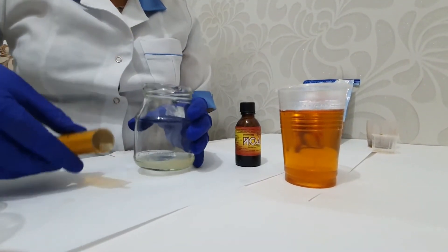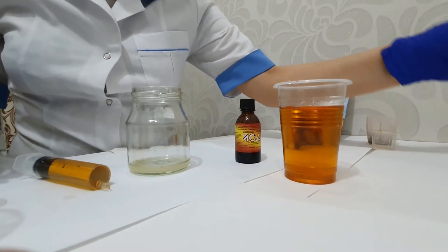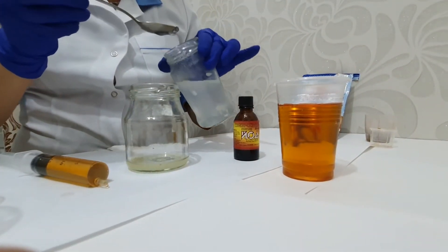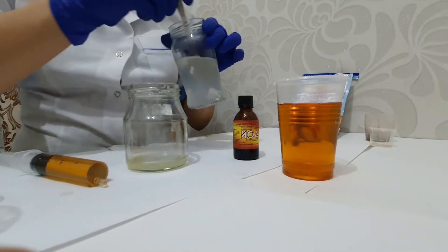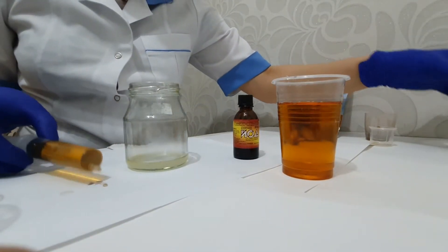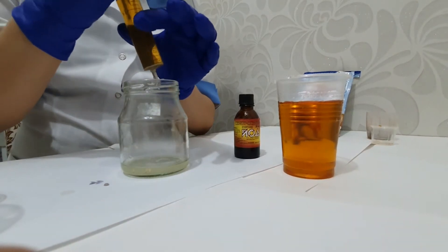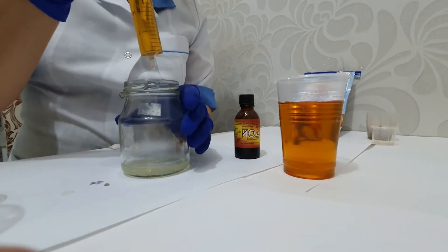Before the titration starts, we need to add the starch indicator. The starch indicator will help us determine the endpoint of titration. Now I start to add the iodine solution drop by drop.